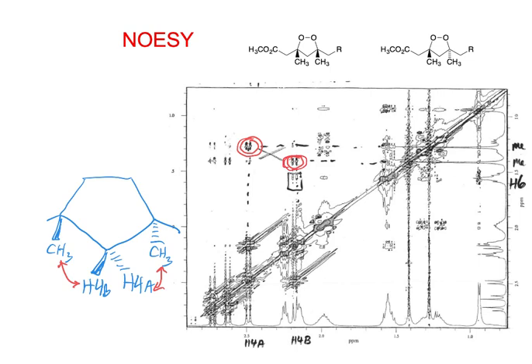Right, and this one here still goes on to H6 as well. So we know that's the methyl group at the 5 position, right?